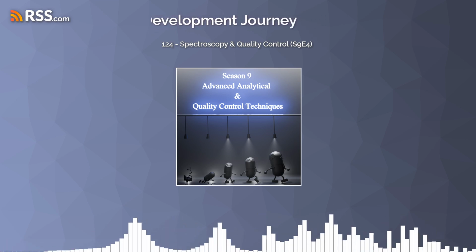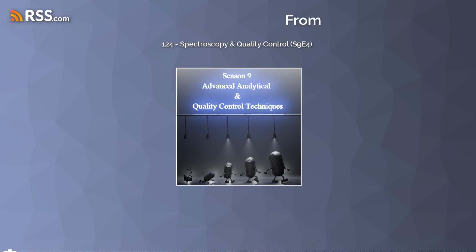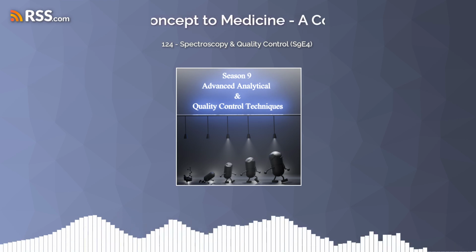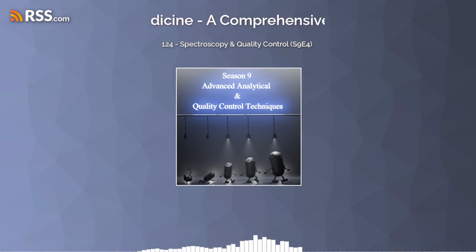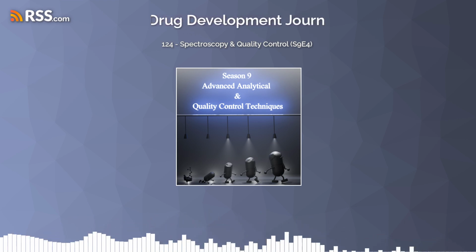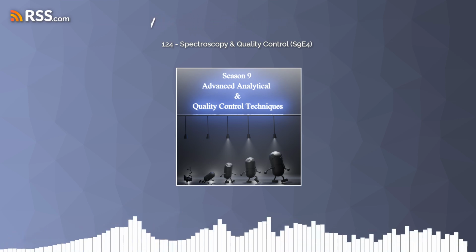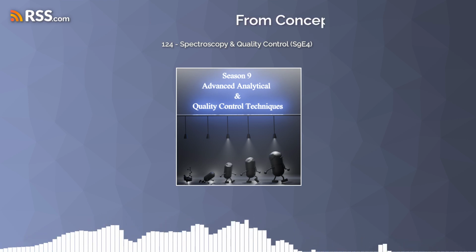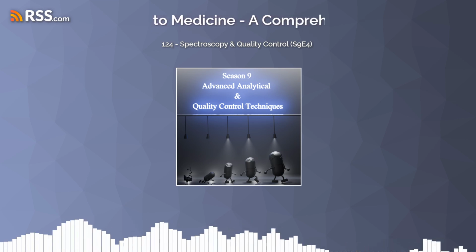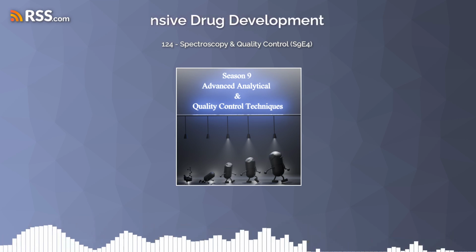What about infrared or IR spectroscopy? So IR spectroscopy looks at a different part of the electromagnetic spectrum. This one tells us about how molecules vibrate. So when a molecule absorbs infrared light of a specific wavelength, it causes its bonds, its chemical bonds, to start vibrating, right? And those different functional groups, different parts of a molecule, they vibrate at characteristic frequencies. So, for example, a carbonyl group or a hydroxyl group, these are different parts of a molecule. They're going to vibrate at different frequencies.